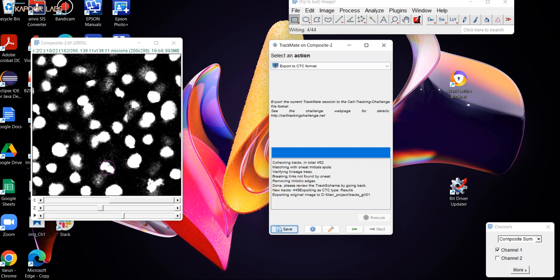Then I'm going to save just the simple LAP tracker results, and I'm also going to do a tracking where I will take the LAP tracker and then correct it with ONeat without splitting, with splitting, and then out of all of these metrics, I can draw some conclusion about what is the best methodology that you can follow to get most accurate tracks.